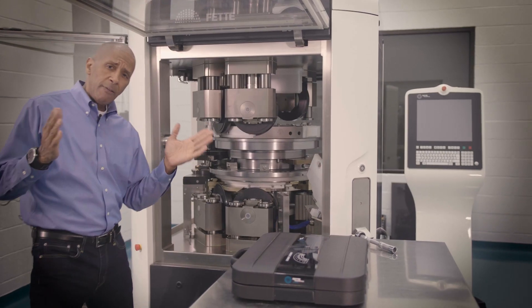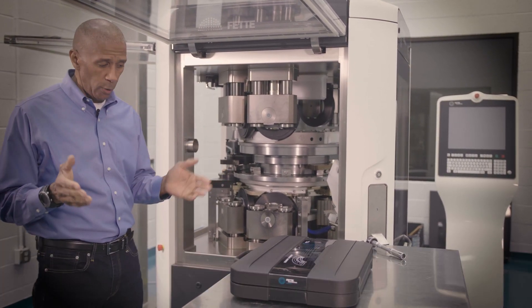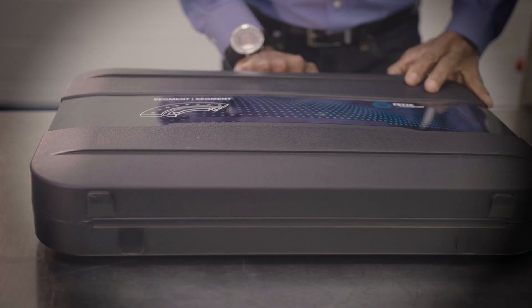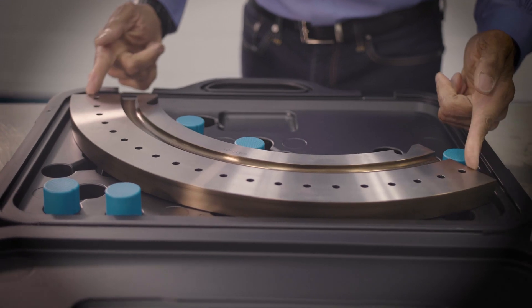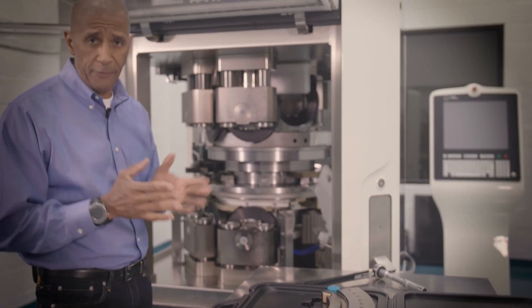This innovative technology can offer maximum output, ease of use, and quicker changeover. The standard Segment die table offers 60 die cavities — 20 die cavities for 3 plates. A standard die table will offer 50 stations.